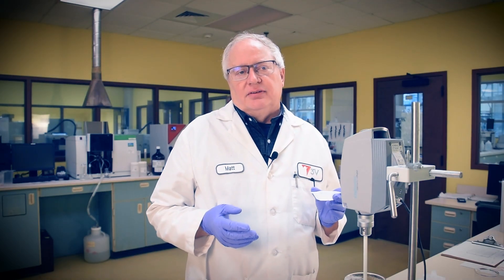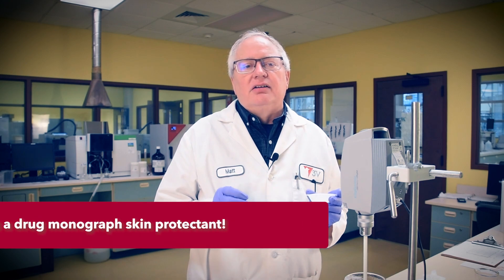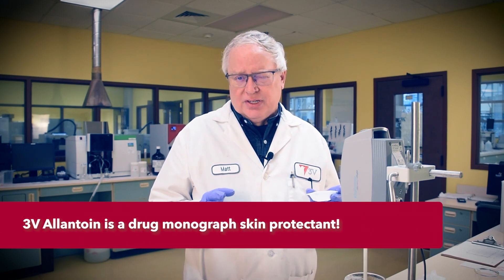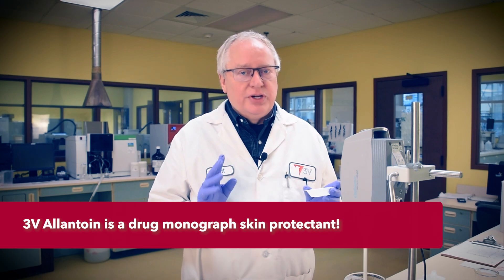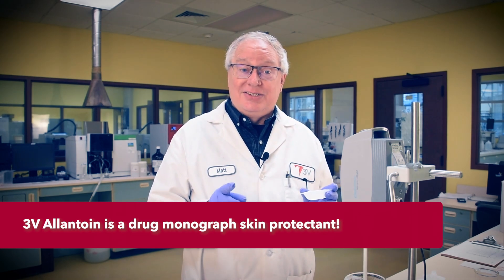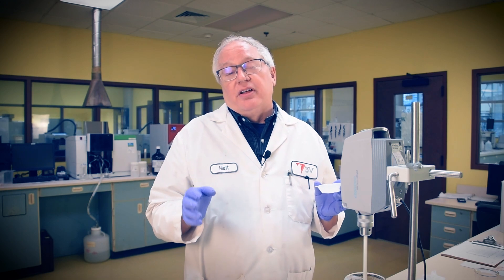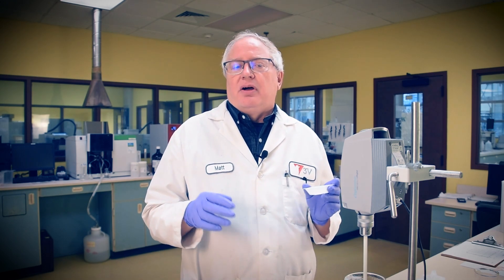Now that the urea is dissolved, let's add a healthy amount of 3V allantoin to help with the keratolysis. Usually allantoin is difficult to dissolve into water, but not when urea is present — urea enhances the solubility of allantoin. That's something to remember. Both work together quite well at foot renewal in a product such as this.